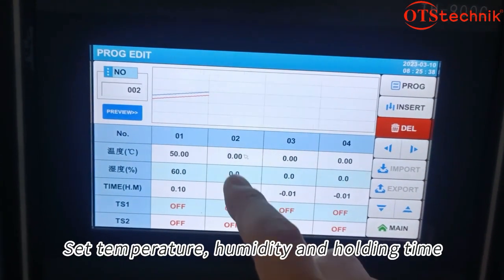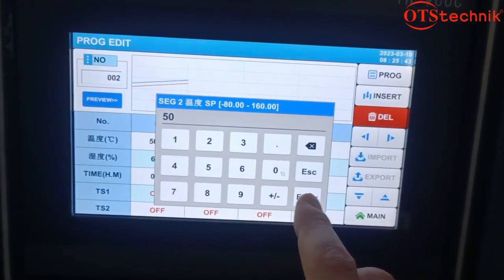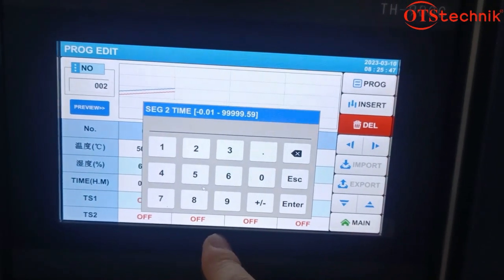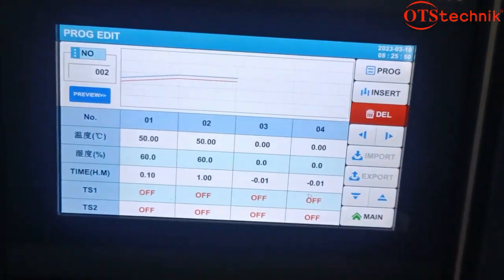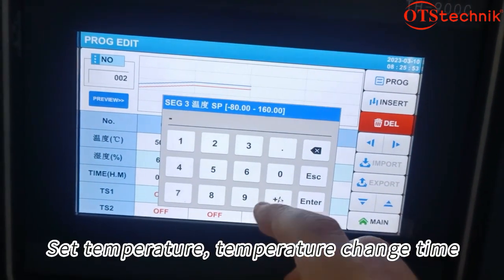Set the temperature, humidity, and holding time. Then set the temperature and temperature change time.